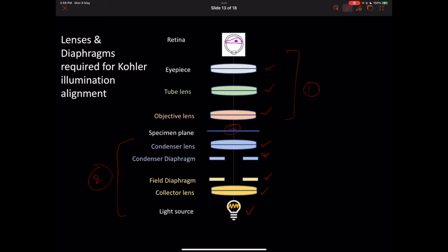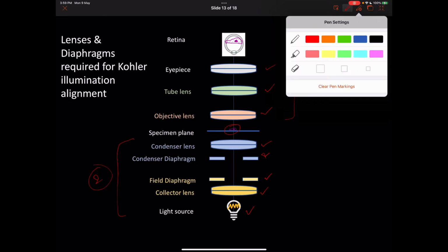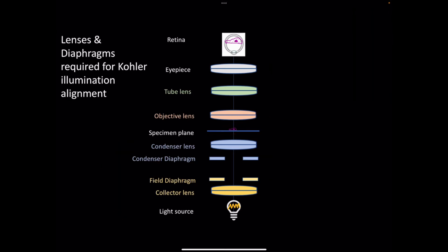When I say that the microscope companies providing these commercial microscopes have fixed some parts in terms of their alignment, it means you cannot move these parts to align them, as they are already aligned. For making our job simple, this was done. So we can see that the first element is the light source, and after that we have the collector lens, both of which are fixed in their position. So we will put a transparent box around them. Both of these elements are inside a packed case, so you cannot even see them, forget about moving them.